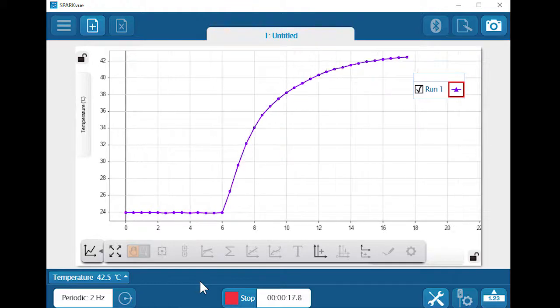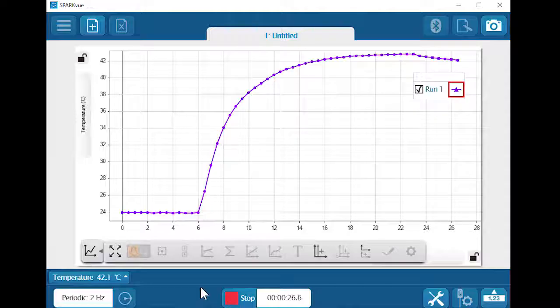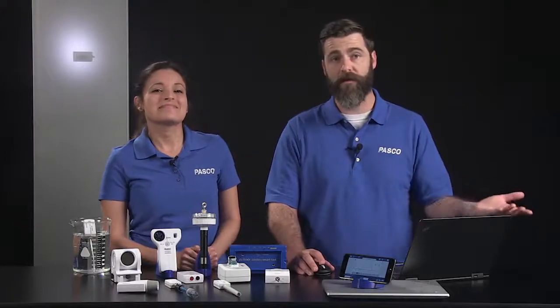We'll know that we've reached the actual water temperature when the graph levels off and stabilizes. Oops — but look, the sensor is still working. Wireless sensors commonly used with solutions, such as temperature, pH, and conductivity, are water resistant.